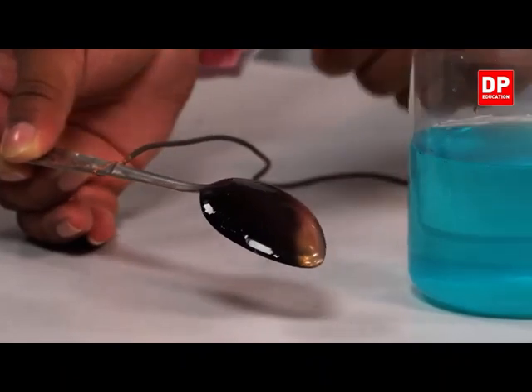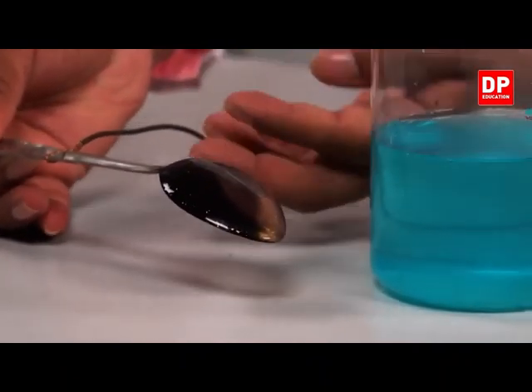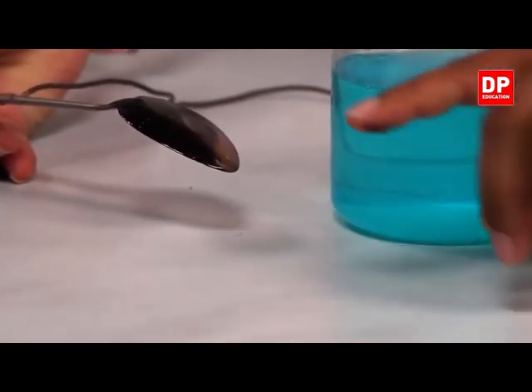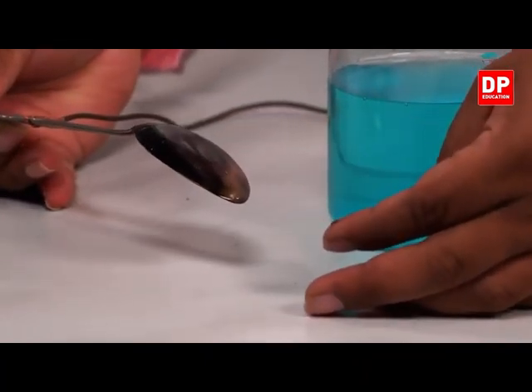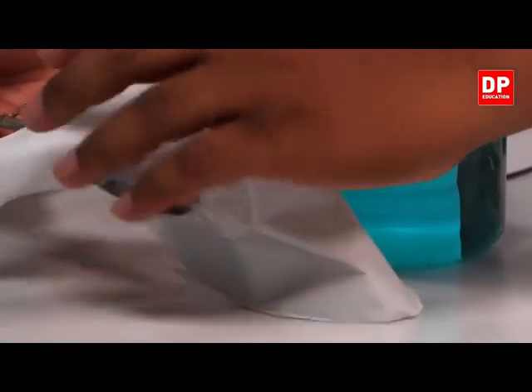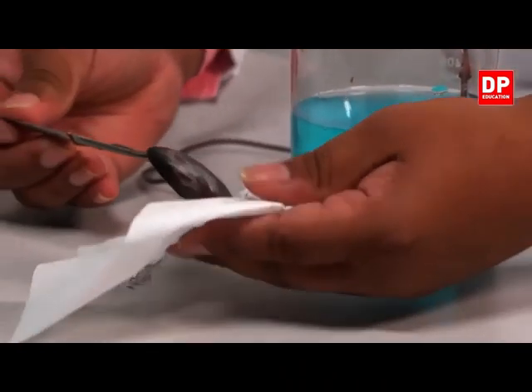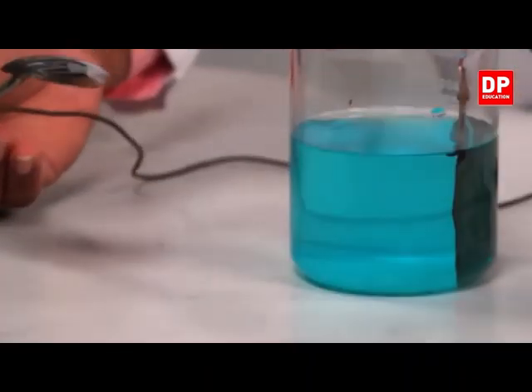substance on the spoon. See? So there is a brownish color substance. Right? I can wipe it off using a tissue paper. I'm going to wipe it off. See? So this substance is copper. So copper is getting plated on the spoon.